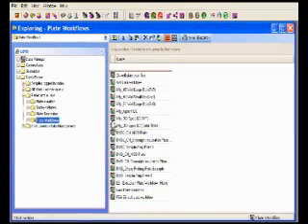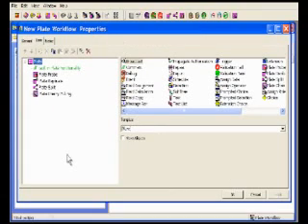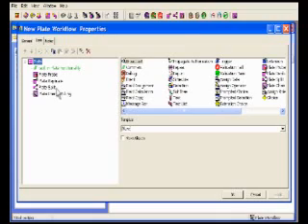The intuitive and logical plate workflows allow users to easily automate plate handling, including common actions such as probing, replication, plate splits, and cherry-picking.